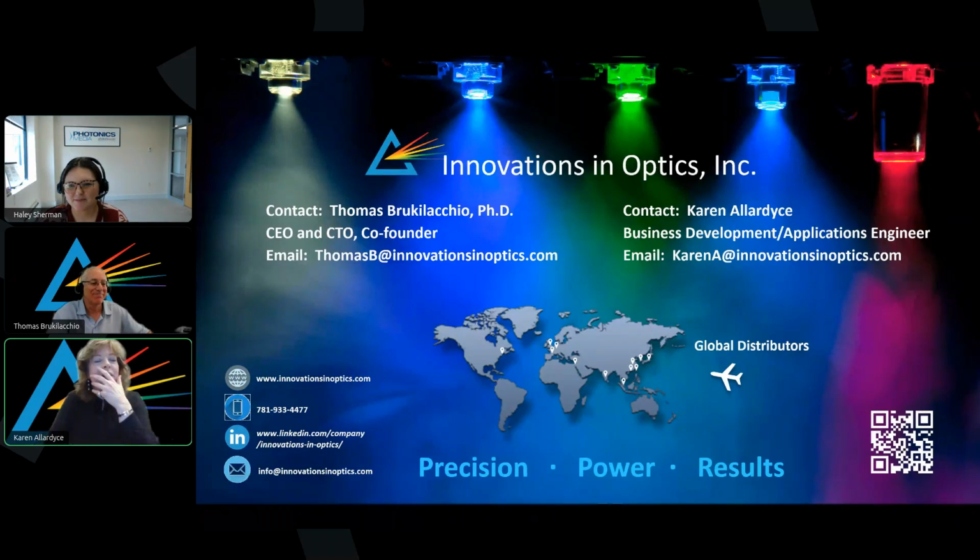Let's see. Yeah, Tom talked a little bit about this, the xenon flash lamps versus LEDs. But pulsed illumination, of course, is a challenge. They generate extremely high peak power because the stored energy is released through a small plasma arc, right? So LEDs can't match that peak pulse energy of a xenon flash, but they provide other advantages like wavelength selection, pulse-to-pulse repeatability, synchronization accuracy, those types of things.